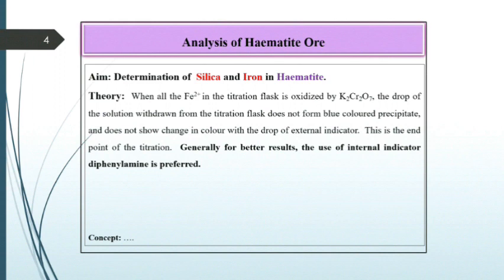When all the Fe2+ in the titration flask is oxidized, the solution does not show change in color with the drop of external indicator. This is the end point of the titration. Generally for better results, the use of internal indicator diphenylamine is preferred.